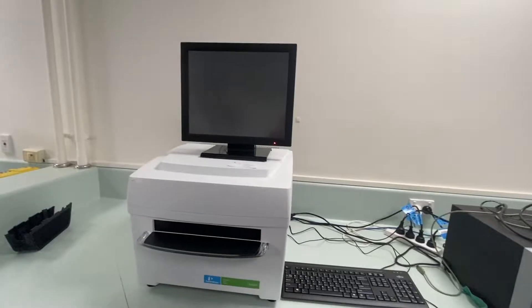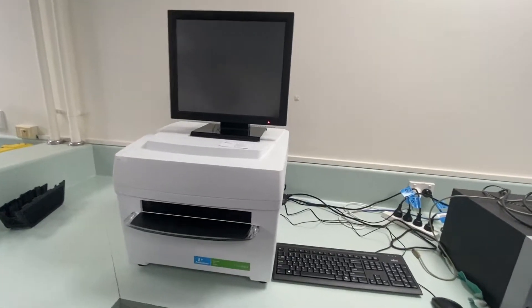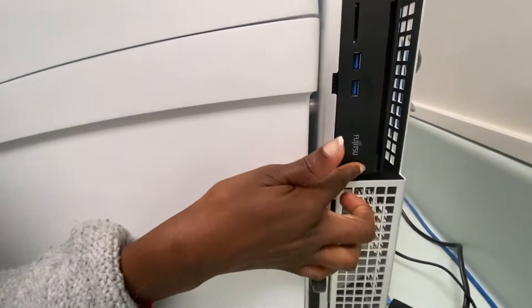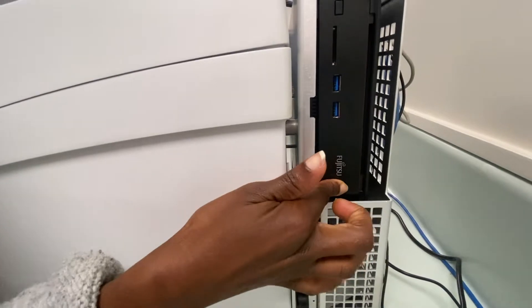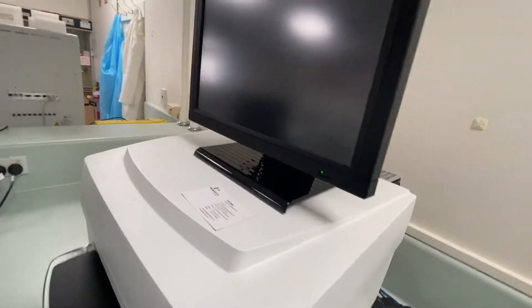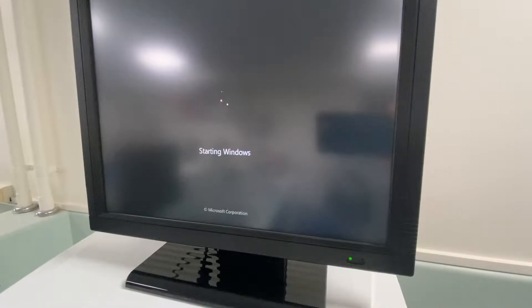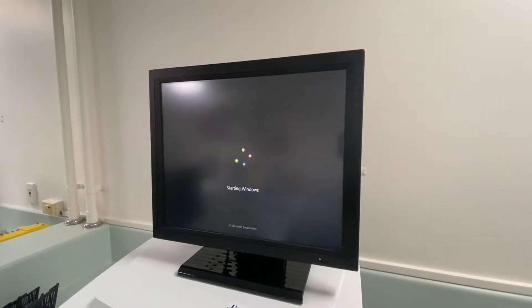Here's a run-through of how to set up the Perkin Elmer Envision plate reader. The first step is to power on the equipment. To do this, you first turn on the computer, which will be at the back. Once the computer is powered on and the Windows program has started, then you turn on the actual plate reader.